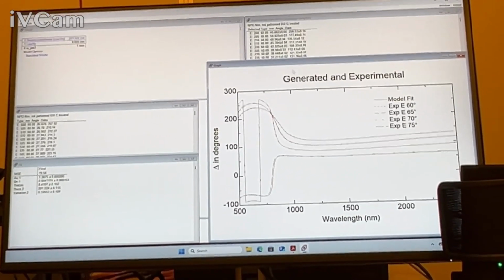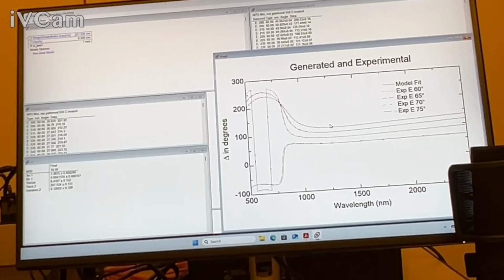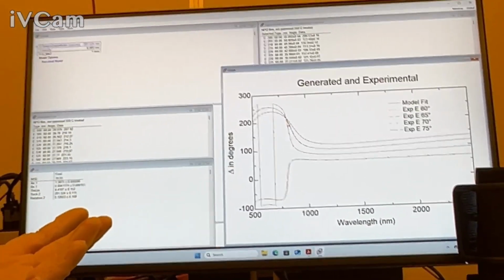We had like 2,000 measurements or something. It was a lot. If you didn't use the auto retarder, again, this wouldn't go over the full range, but you would likely have gotten the same solution regardless.